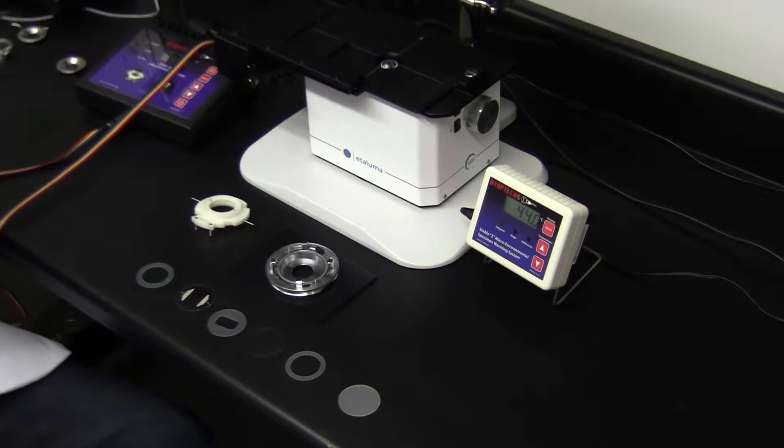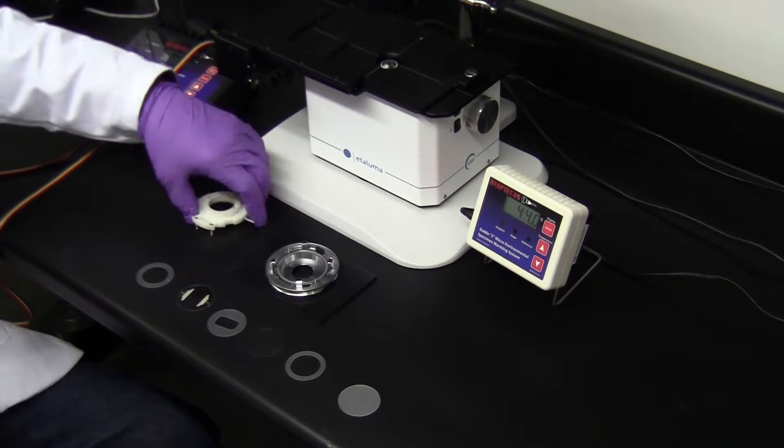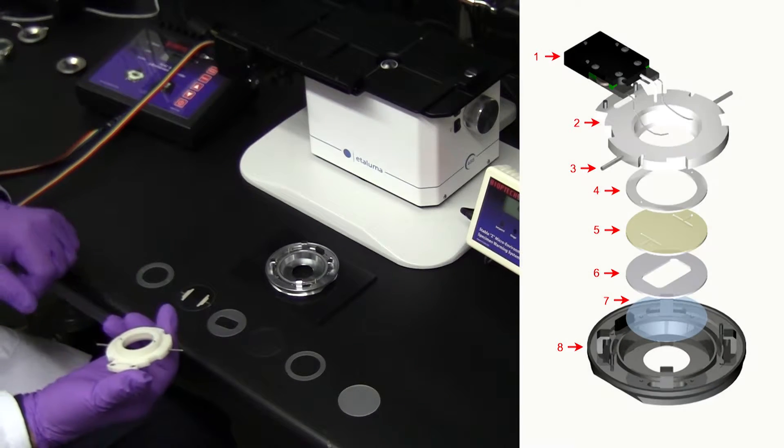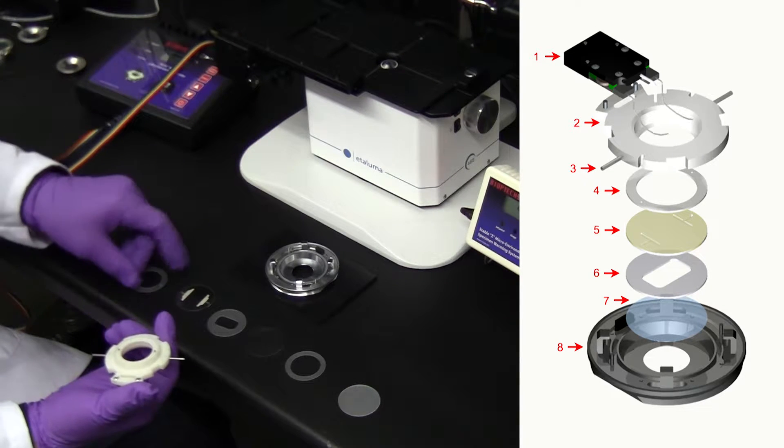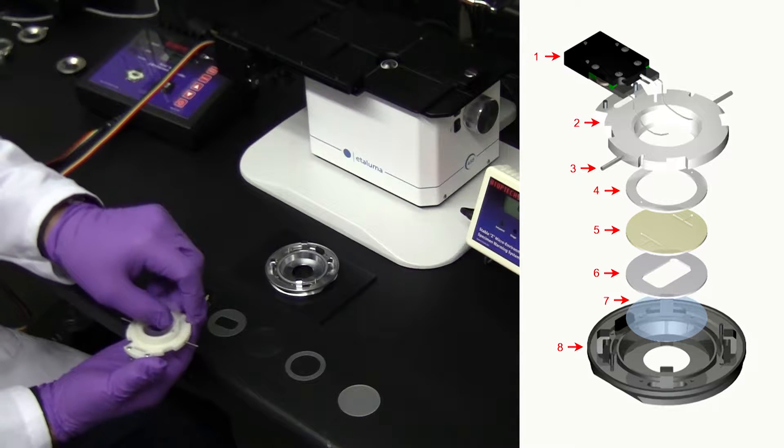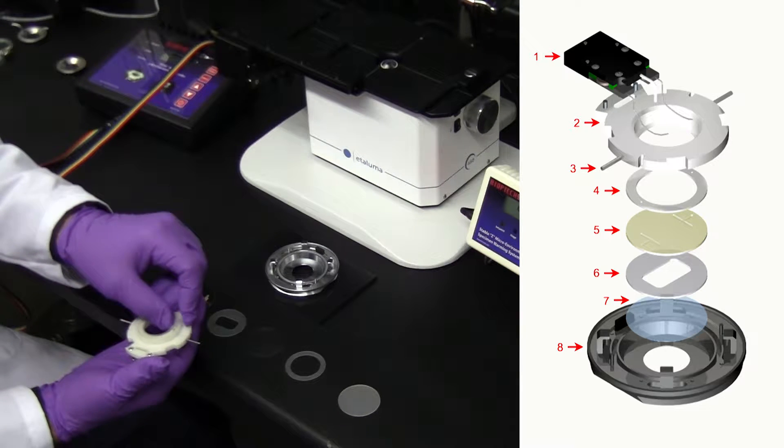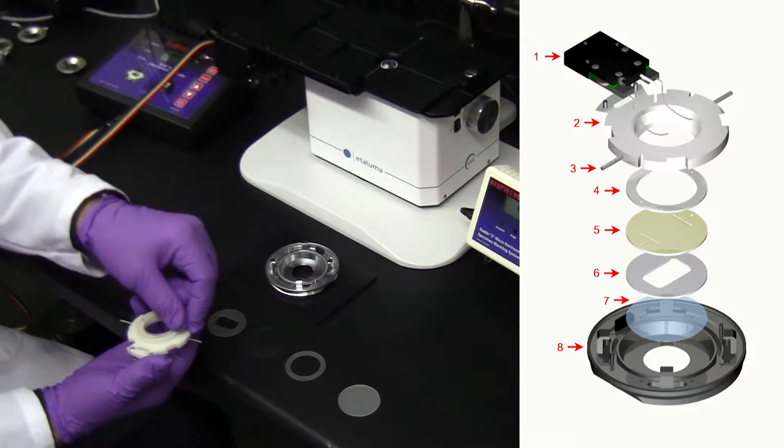They are assembled without the need of tools. I'll start by turning the top upside down, exposing the inflow and outflow perfusion ports. When assembling, a gasket is placed on the bottom surface of the top to seal the perfusion flow that passes through the optical cavity.